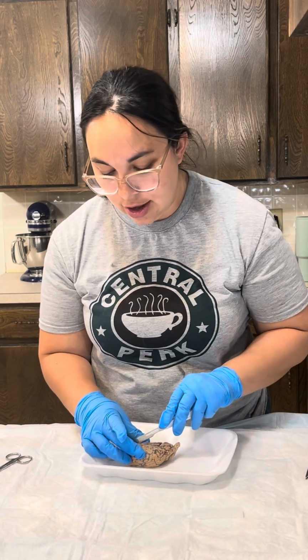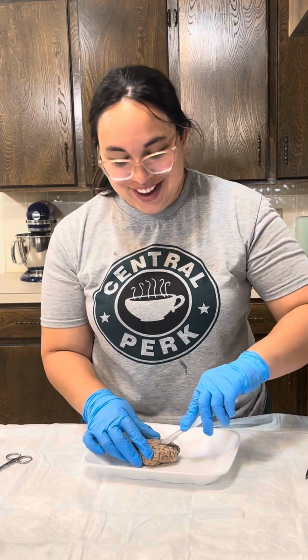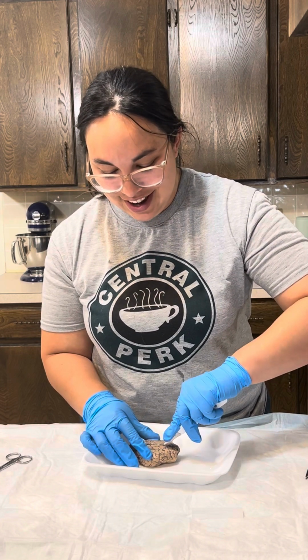And we're going to look at it inside. So we're going to do a sagittal cut. It's okay. You can close your eyes. We're going to do a sagittal cut through the longitudinal fissure right here.